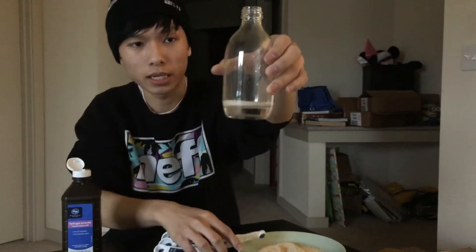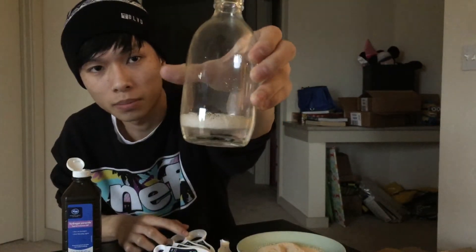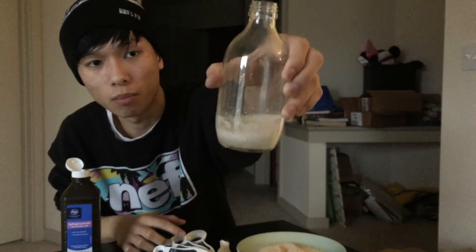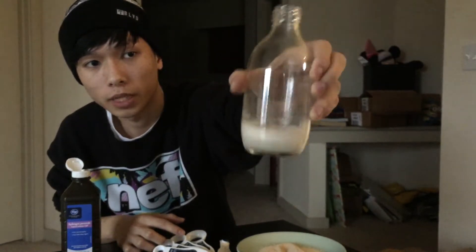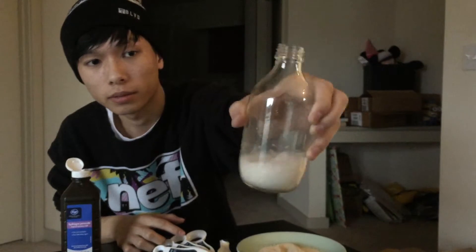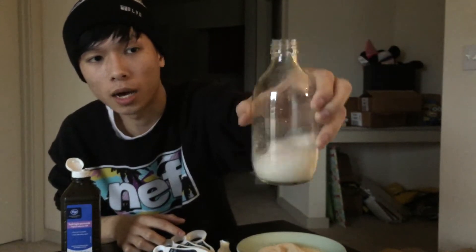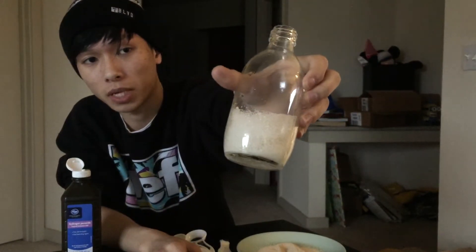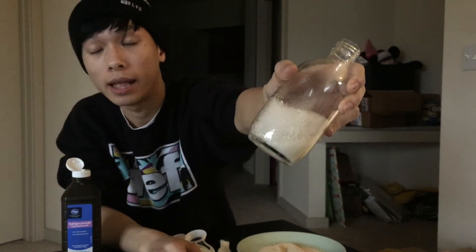You can see bubbles coming out. When you shake it, even more bubbles come out. This is a very dramatic chemical reaction. You can see so many bubbles coming out. Some yeast hasn't reacted yet, so keep shaking it — and you get so many bubbles.